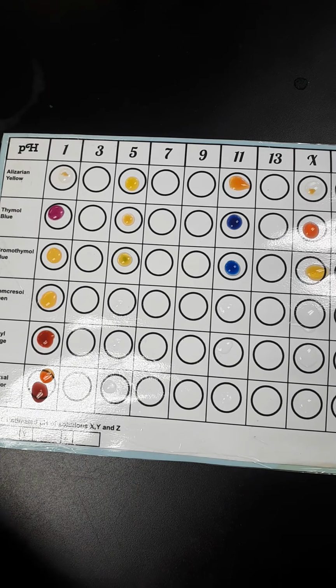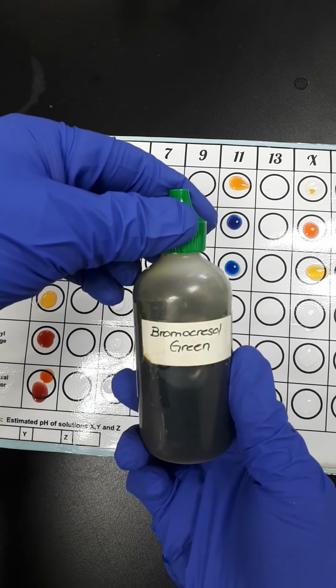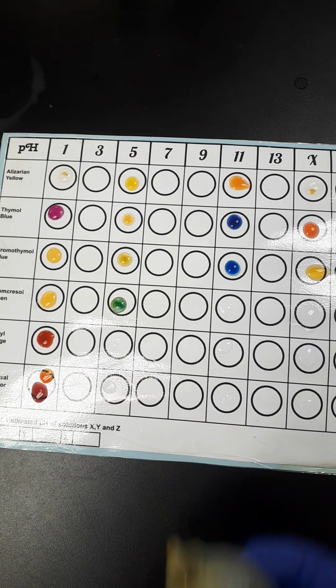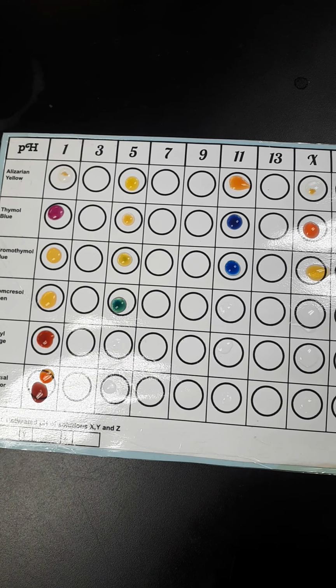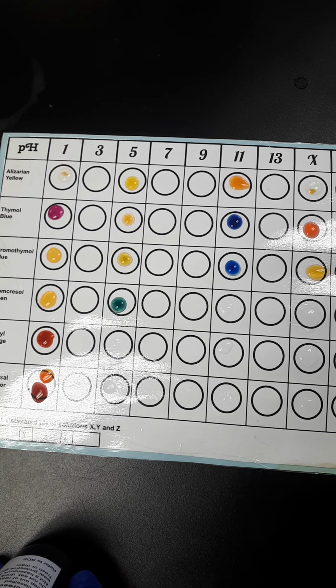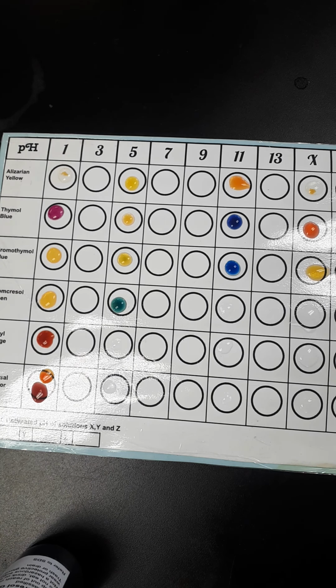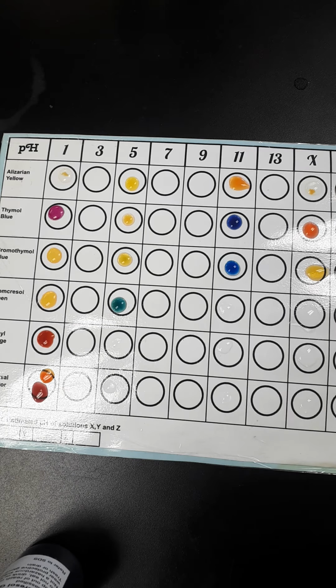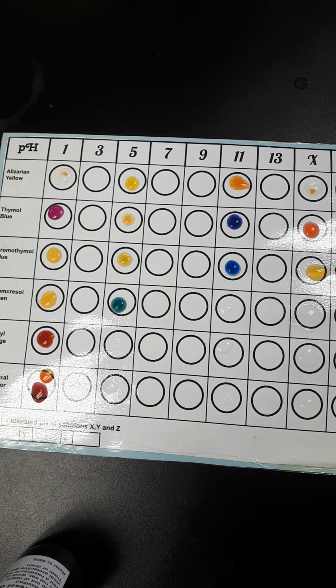Let's go to bromocresol green. Very nice. pH of 5. That's kind of a neat one. It turned a whole bunch of different things. That one turned, I would definitely call that one green, which is perfect. It's still kind of reacting, doing really weird things. I wonder if you can see that on the camera.